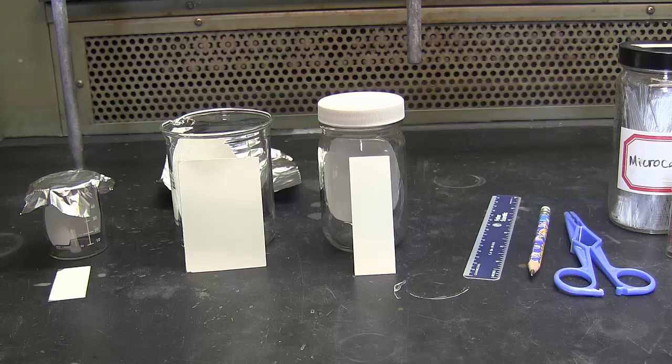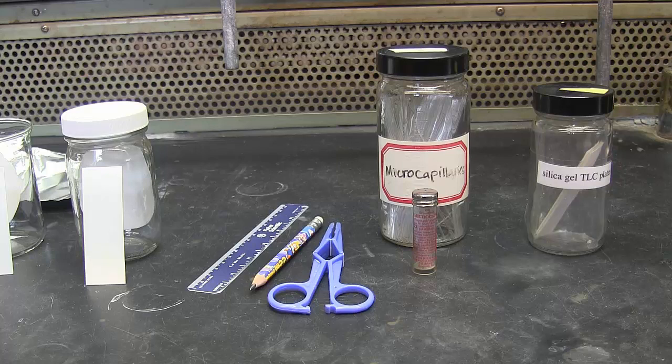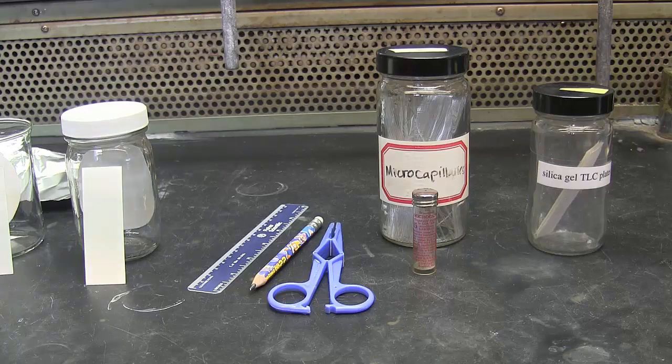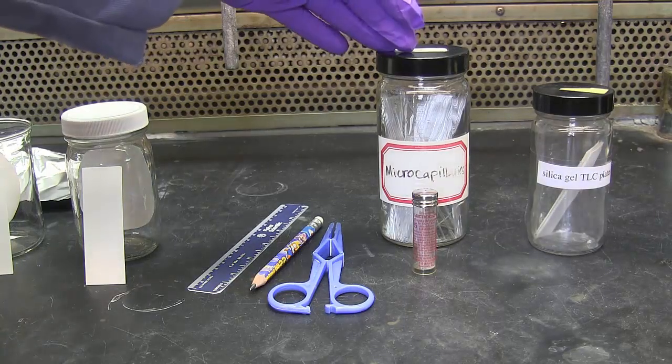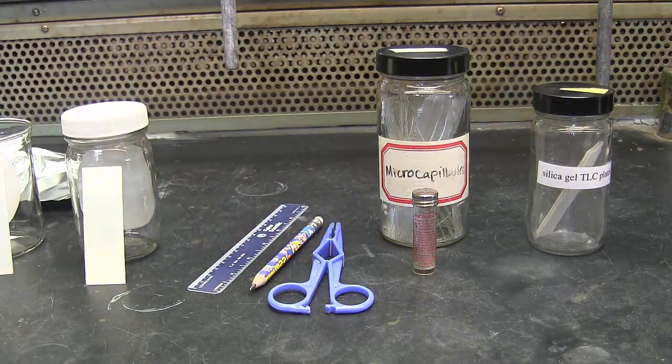Other things you will need to gather include a ruler, a pencil, a pair of tweezers, and something to make spots on your TLC plate. You can use either micro capillaries or micro pipetters. My personal preference is the micro pipetters.